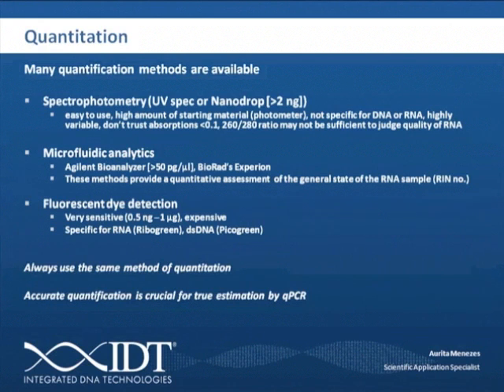Okay, that's great. We'll look at another question then, which is maybe more non-cost related. Do most primer and probe design tools look at both strands? I can't say for most, but our design tool will be looking at both strands. For our PrimeTime pre-designed qPCR assays, we would look at both strands. But I cannot say for the other tools.